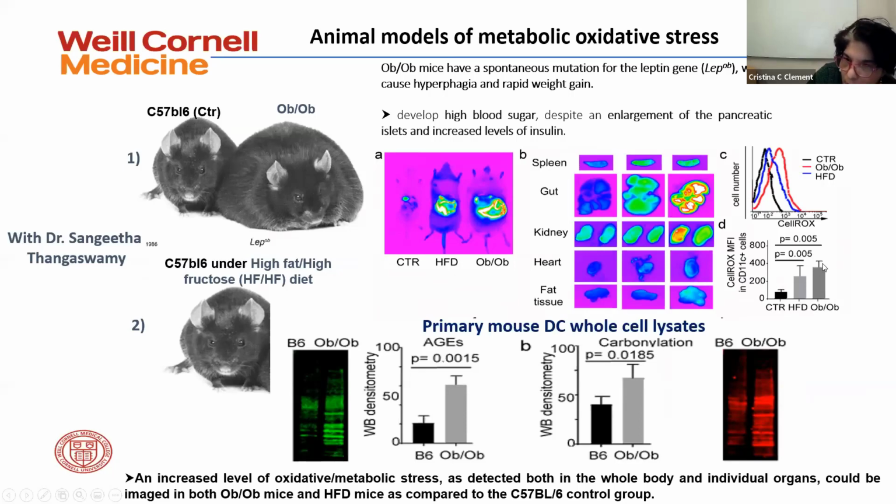It doesn't show the MHC class 2 upregulation. That's a very good point for a cellular biology type of analysis. Still, we have FACS analysis, and MHC class 2 was upregulated for some of them.